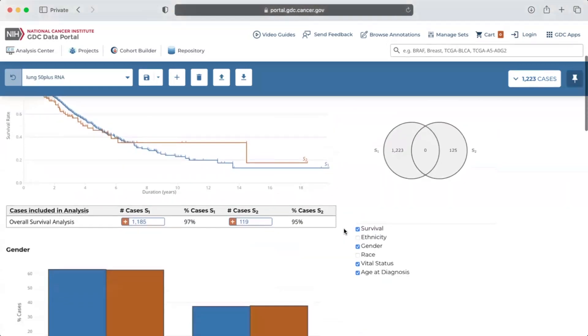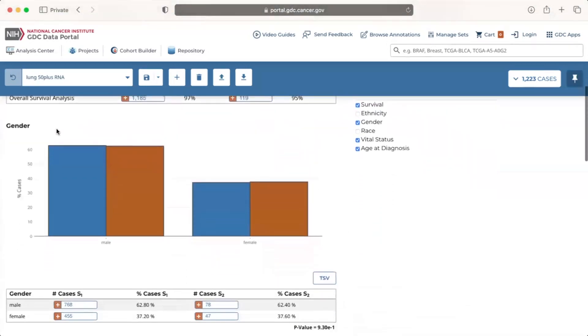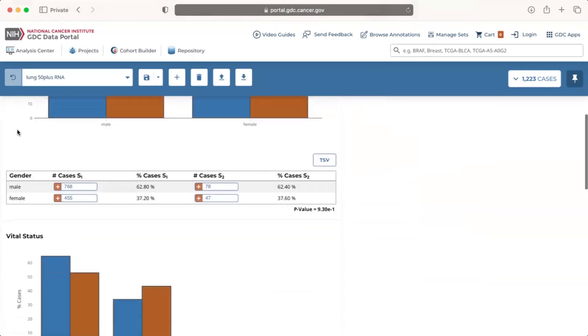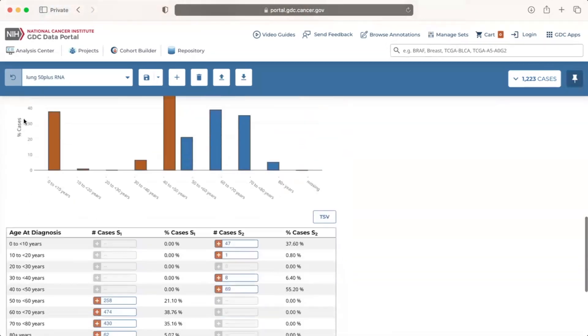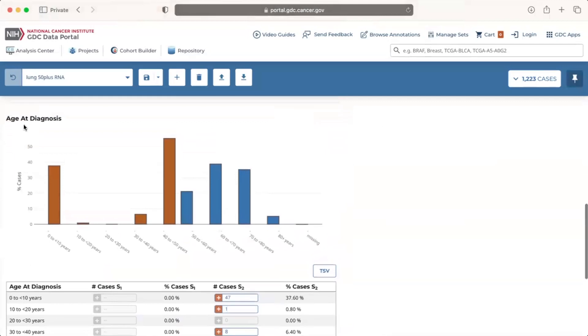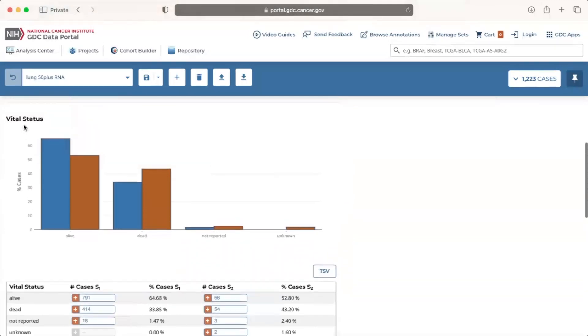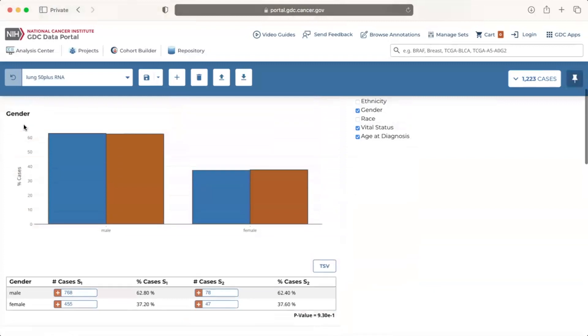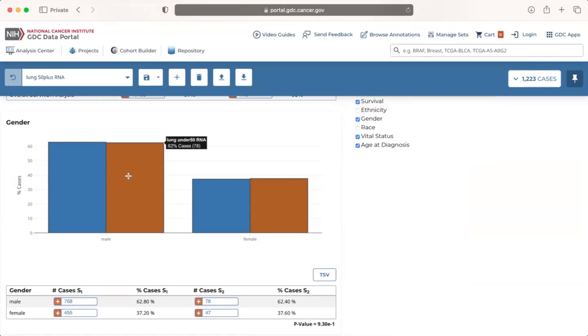Scrolling down the page, bar plots and tables for certain clinical facets are displayed below the survival plot, including gender, vital status, and age at diagnosis. Each bar plot compares the percent of cases between the two cohorts for each category. For example, the gender bar plot shows that there is a slightly higher percentage of males among lung cancer cases with RNA-seq data aged 50 plus in blue, compared to those less than 50 years old in orange.